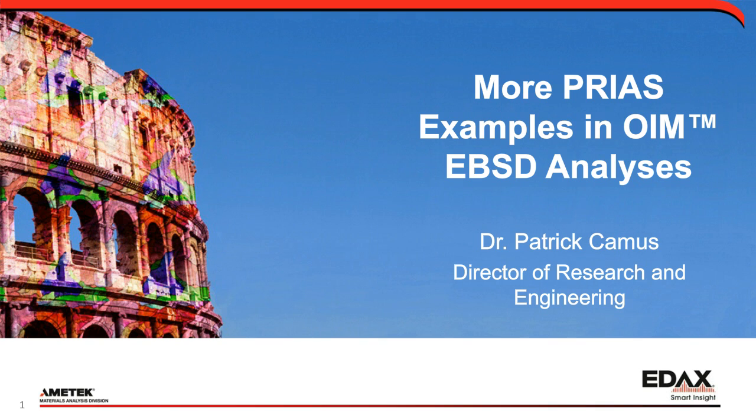Today I'd like to show you a few examples of PRIAS imaging and options. PRIAS is an imaging method that can be used when performing EBSD analyses in an SEM. EDAX has presented a previous webinar on PRIAS that described much of the technical background on this imaging technique. I will review a little of that background now so that new viewers to the technique can follow the rest of this webinar. The majority of this webinar will examine the benefits of using PRIAS to produce a variety of images for fine detail structural characterization during EBSD analyses.